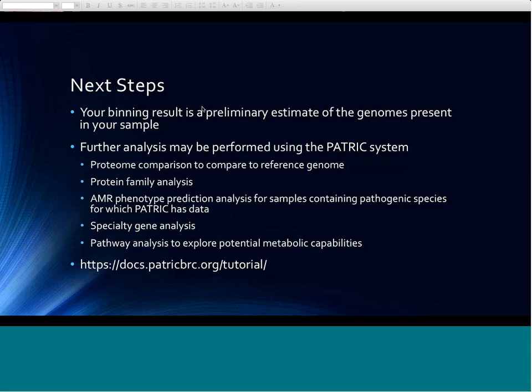Is it possible to upload coverage info along with the contigs if I've assembled the reads myself? Yes. So as it stands, we parse out, actually I should leave this to Bruce. Yeah, there are like 3 or 4 different ways we parse out coverage information.